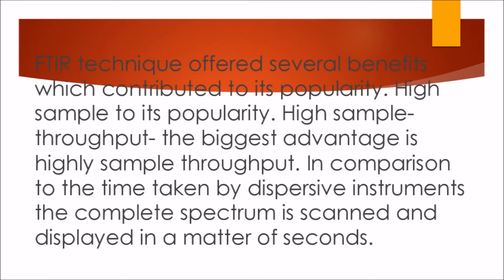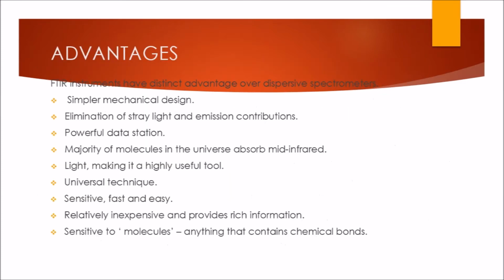The FTIR technique offers several benefits which contribute to its popularity. High sample throughput. The biggest advantage is high sample throughput. In comparison to the time taken by dispersive instruments, the complete spectrum is scanned and displayed in a matter of seconds.